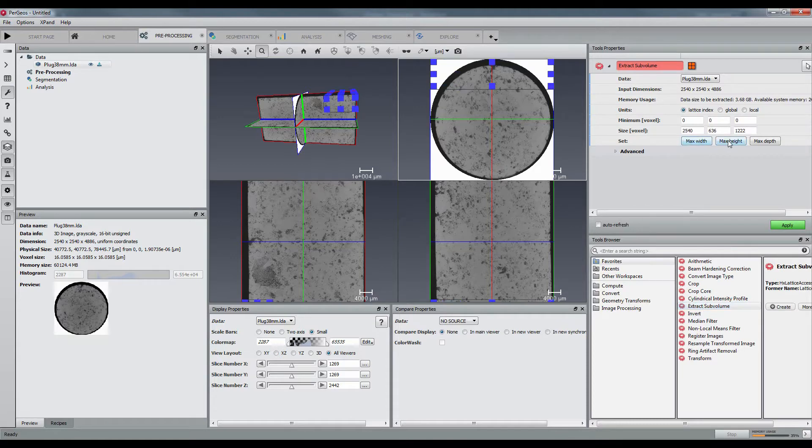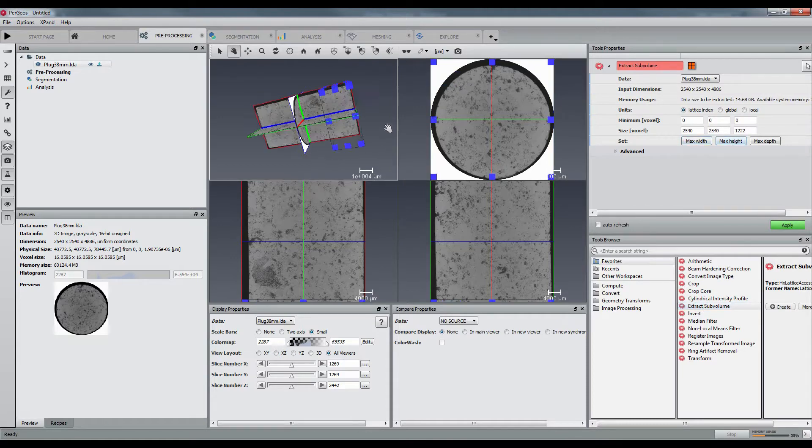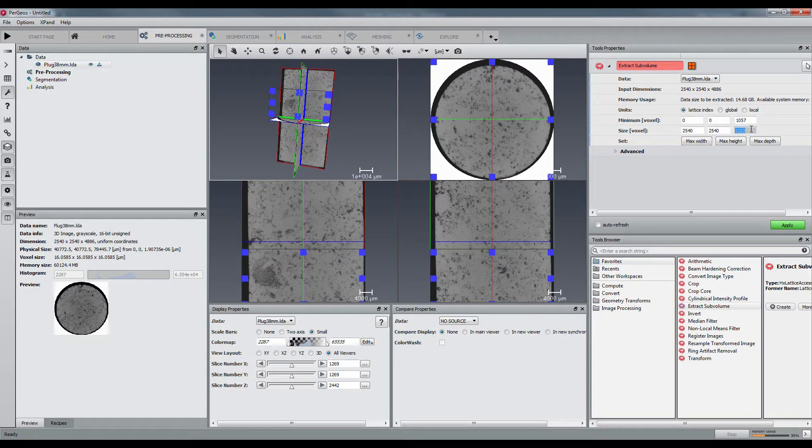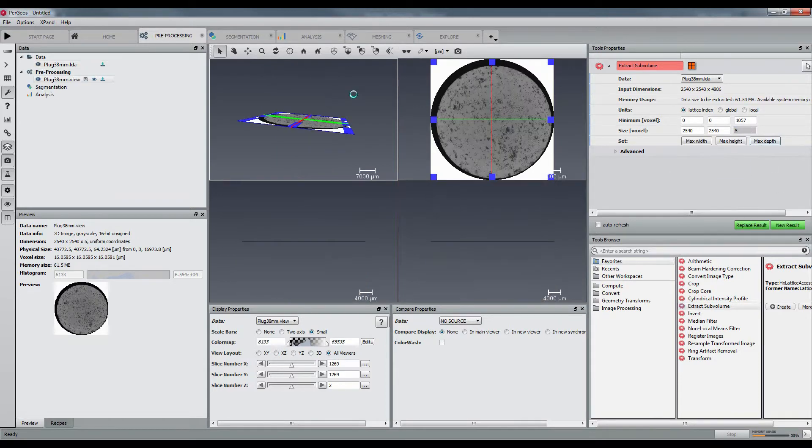Let's first create a recipe based on a few slices of the volume. I am creating an extract sub-volume with maximum width and height and 5 slices in depth.